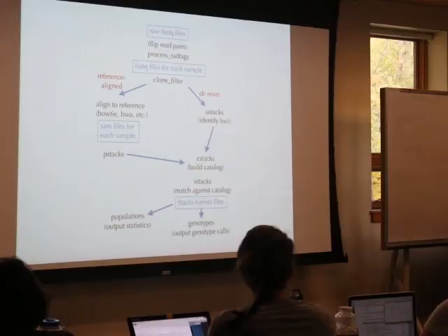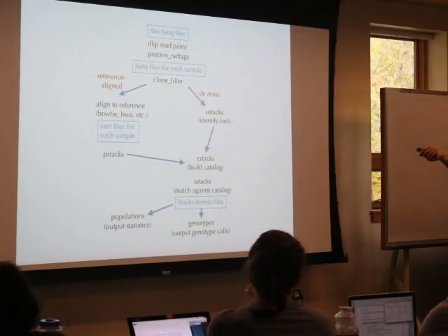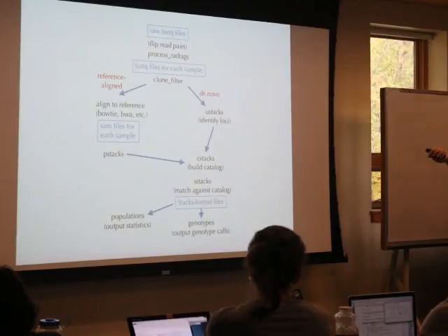There are lots of different PCR duplicate removal programs out there. This one, like some others, depends on sequence similarity. There are also ones that depend on alignment position.